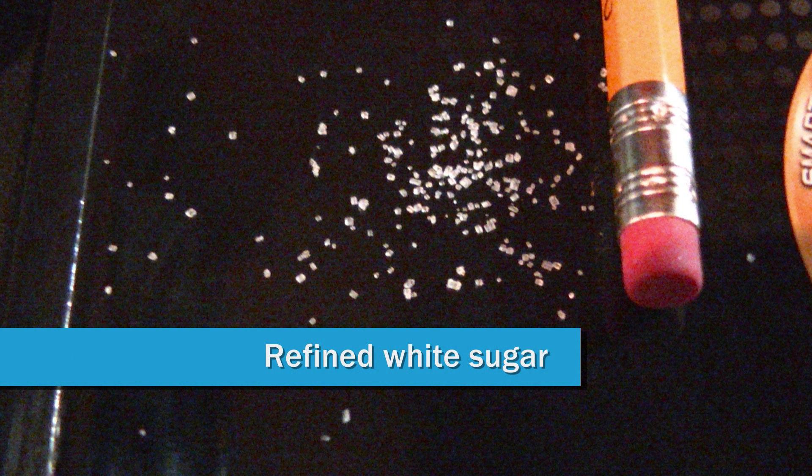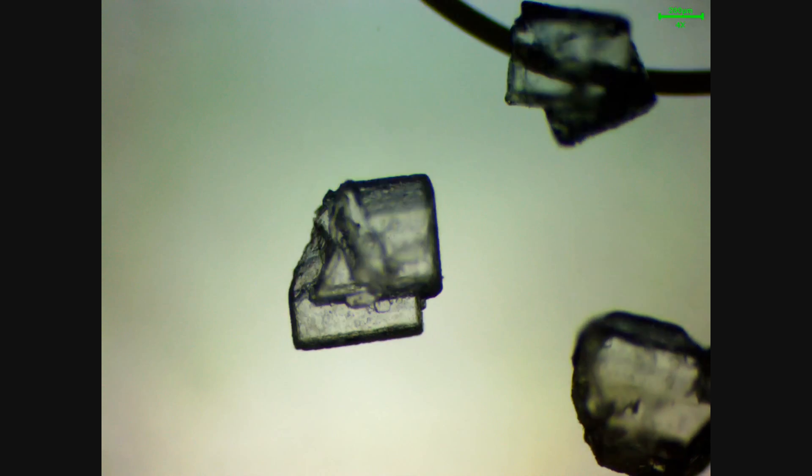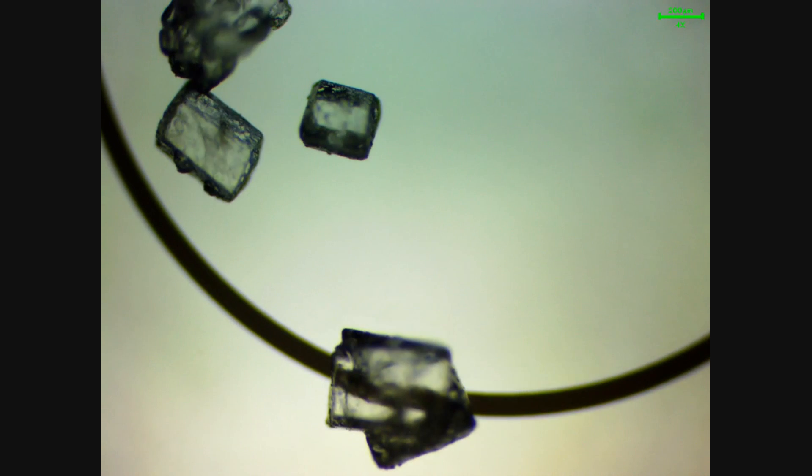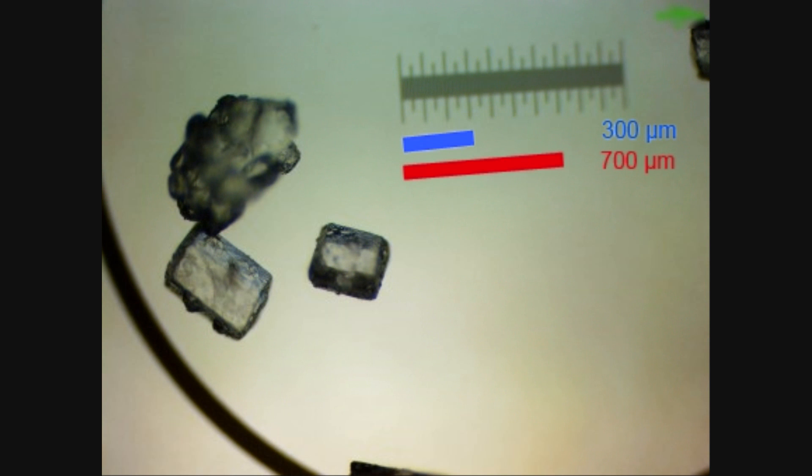First up is refined white sugar, a collection of various sized crystals. They're very irregular-shaped, clumped, clustered, and they range from 300 to 700 micrometers.